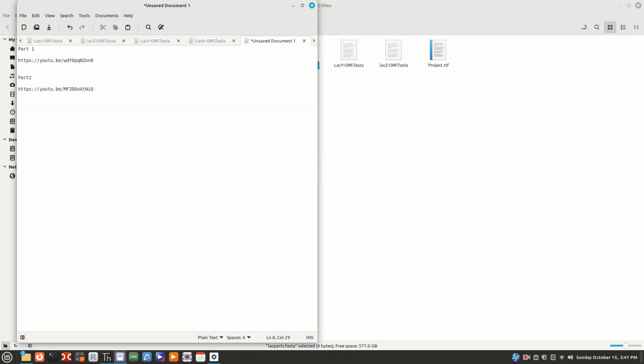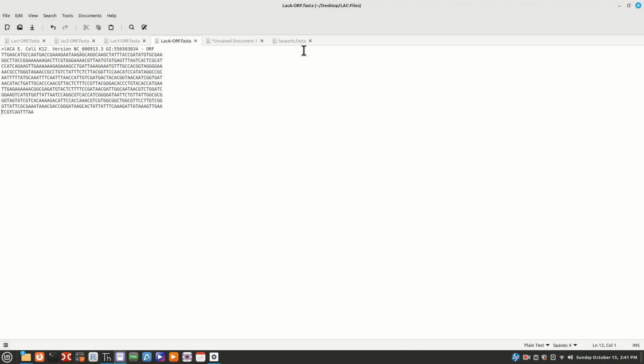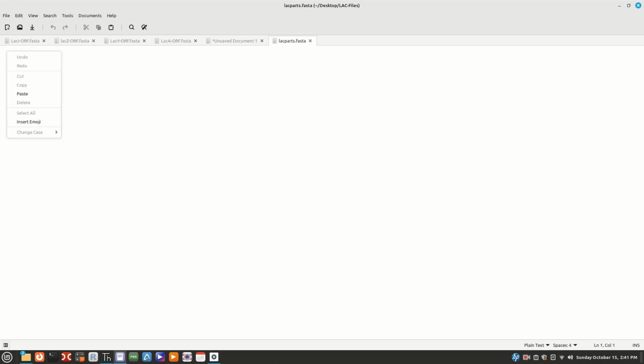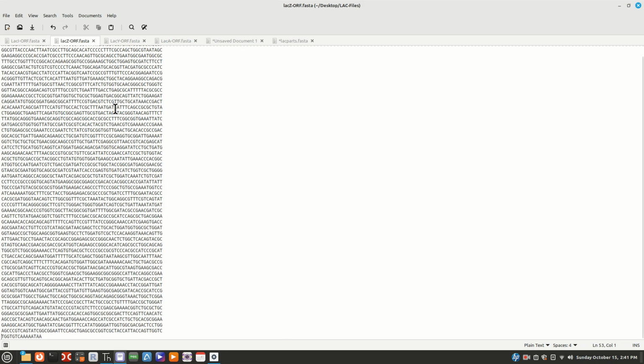All right, and I'm going to go, oh, that's not what I want. Lac parts, and I'm going to do this. I'm going to change this, of course. We'll just call it Lac parts. I, Z, Y, A. Okay, and we're going to grab the others. So I have I. Let's grab Z.